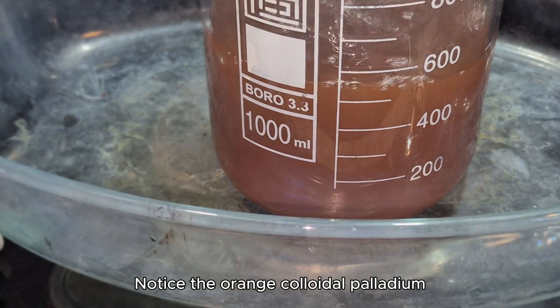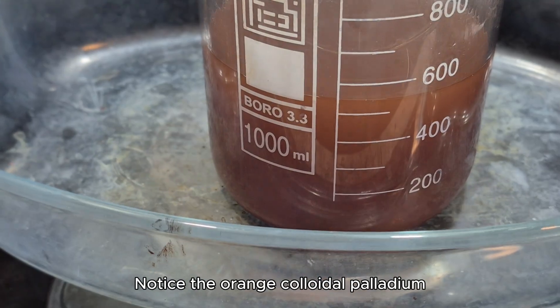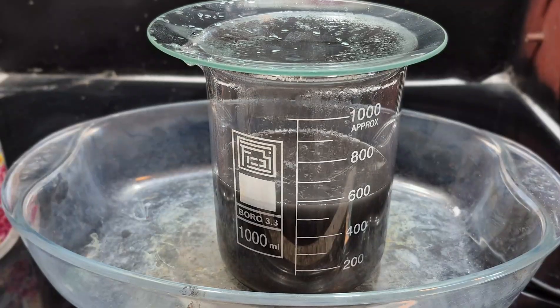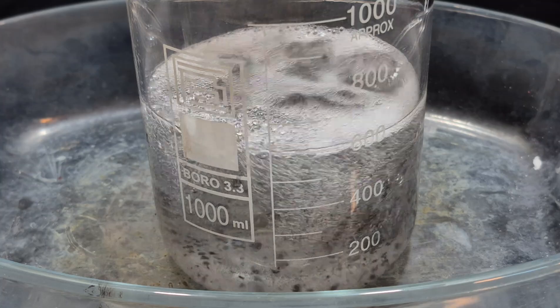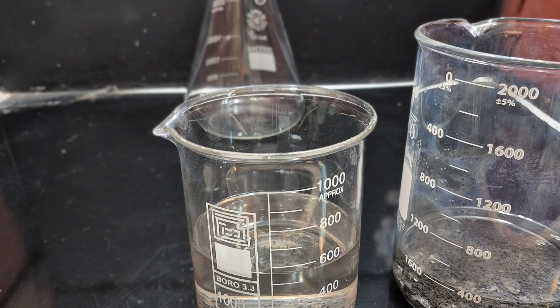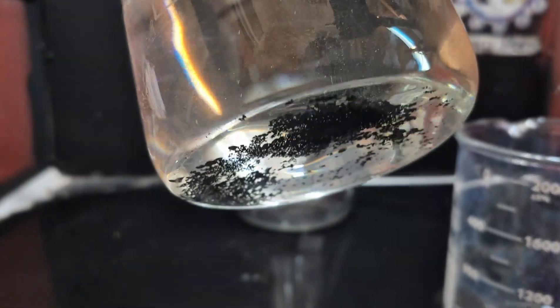I heated the solution and slowly added formic acid to reduce the palladium to its metallic form. Here's the palladium obtained from both the DMG complex and the diamine salt.